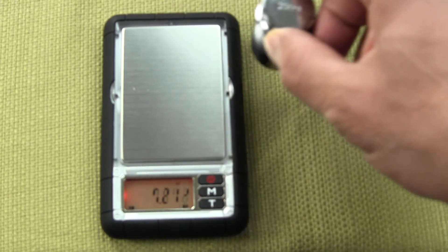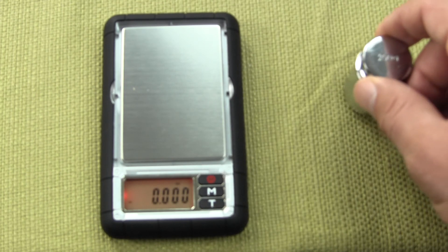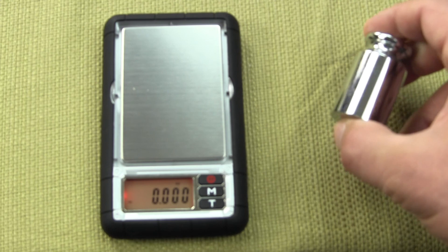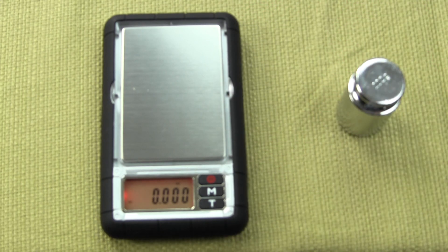That's how simple it is to calibrate the MyWeigh DuraScale D2. Visit us at balances.com for all your MyWeigh products. We do sell the DuraScale and we also offer the 200 gram calibration weight.